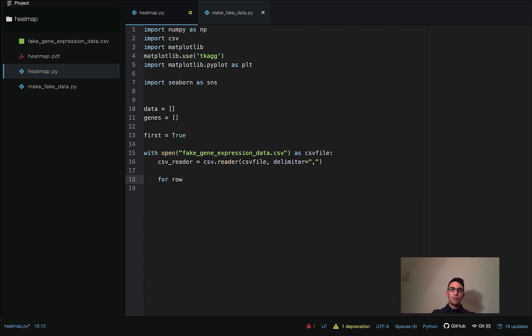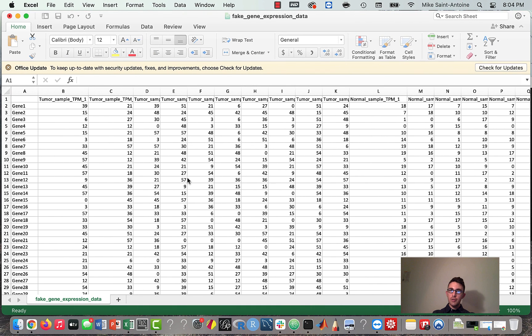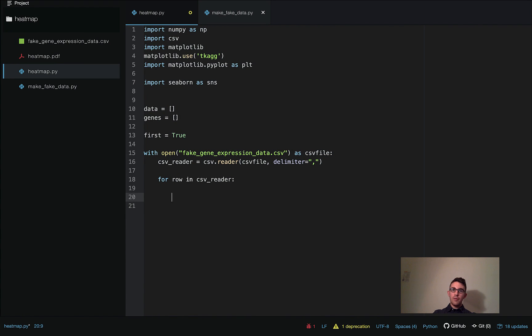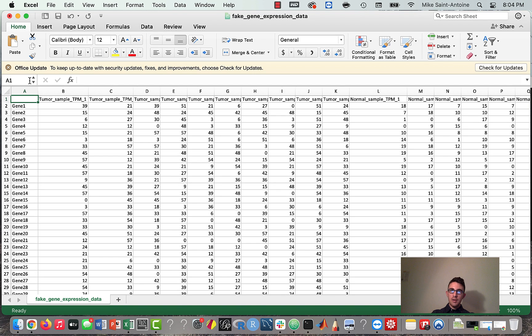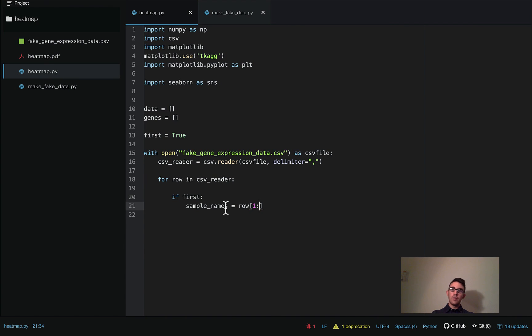Next, `for row in csv_reader` — this will go through each of the rows in our CSV file. We defined the variable `first` to know when we're at the first row. So we say: if `first`, then `sample_names = row[1:]` — starting from the second column onward at index one, because index zero is not a sample name. Then we set `first = False`.